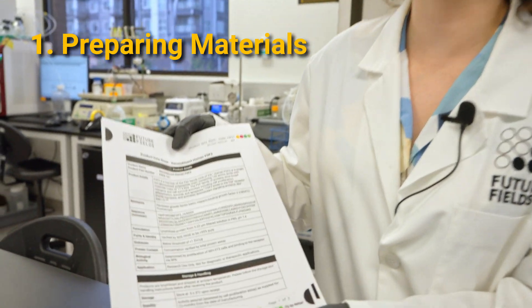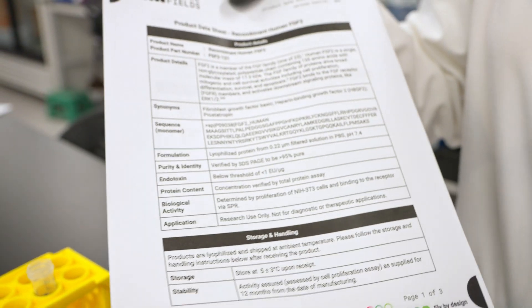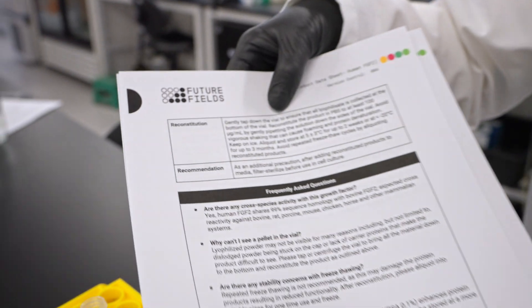Refer to your product data sheet for your specific product to determine your dilution ratio. It can be found in the reconstitution section.